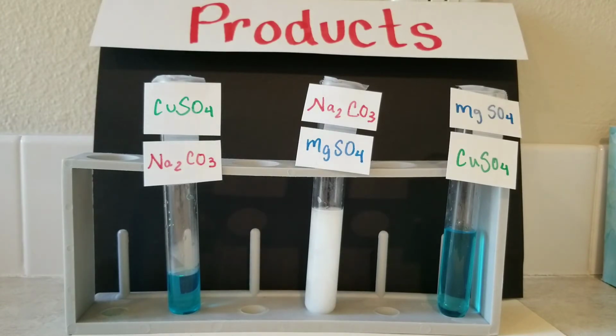And then our last one, we're going to start with the copper sulfate, and we're going to add in the sodium carbonate again and see what happens there. Now remember, we already have blue, so if we end up with something blue in the end, that isn't a new color.